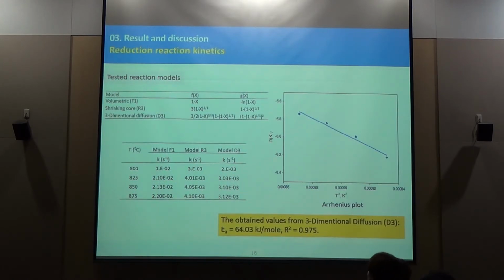In this slide, I will outline some kinetic models: volumetric, shrinking core, and also three-dimensional diffusion. We consider the obtained value of three-dimensional diffusion with this activation energy, like this.